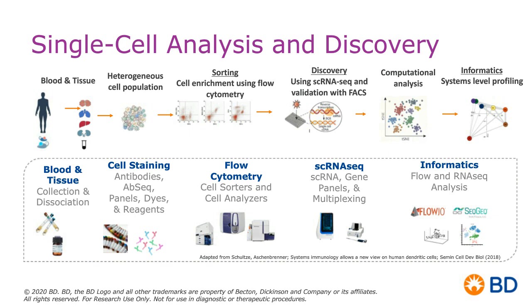And along with that, drive discovery, which involves single-cell RNA sequencing as well as protein analysis simultaneously, which is part of the single-cell RNA sequencing platform called the BD Rhapsody system, which we'll talk about a little bit more as we go through this presentation.